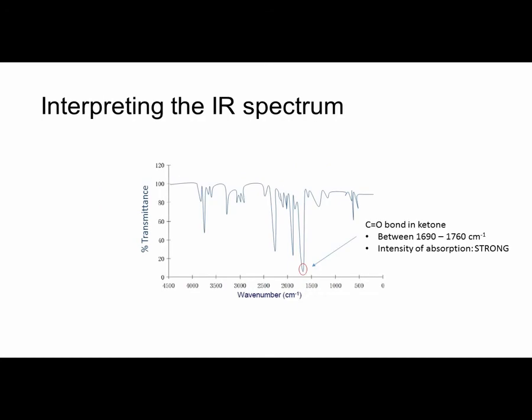Do note that different functional groups and bonds have characteristic absorption bands in the IR spectrum, and this is independent of the other functional groups and bonds in the same chemical structure. Important point to note for all students: you will need to refer to textbooks or other references for the list of characteristic IR absorption peaks for common functional groups.